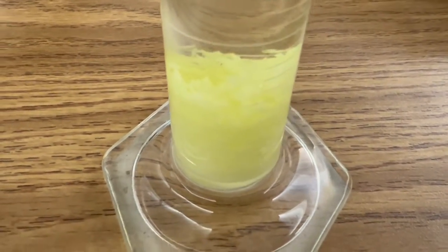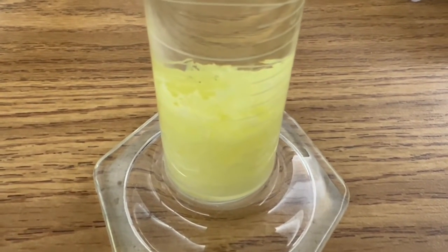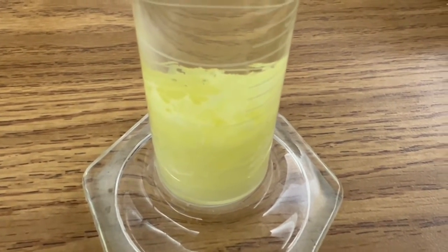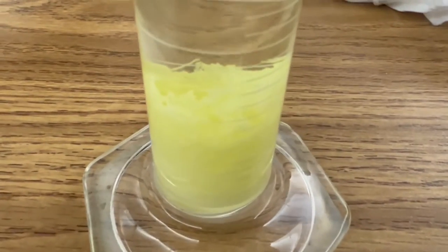Okay, I think all of our sulfur has now recrystallized. Recrystallization is a great way to purify solid compounds. A great example of recrystallization is just the process of making rock candy.